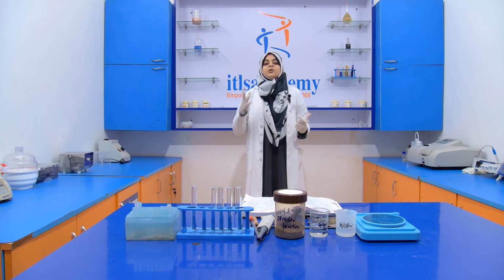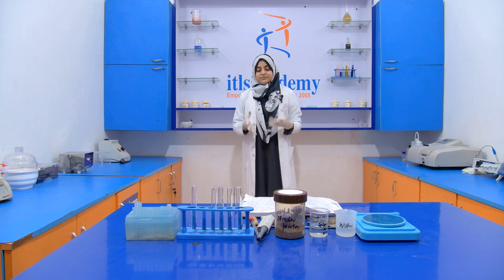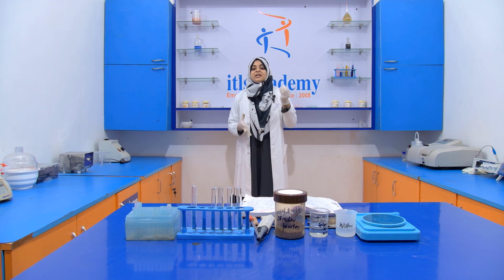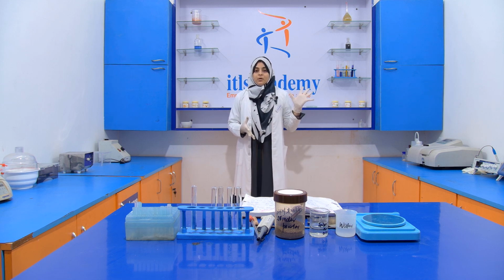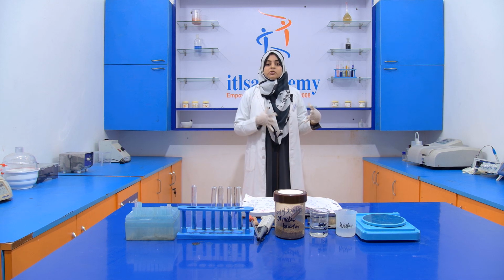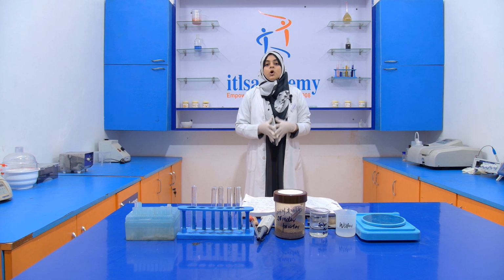Here the adulterant added into the food product is common salt, and the sample that we take is coriander powder. The reason is very simple and similar to the previous one: to enhance the quantity of the coriander powder. The reason behind the addition of common salt into coriander powder is only to enhance its quantity.